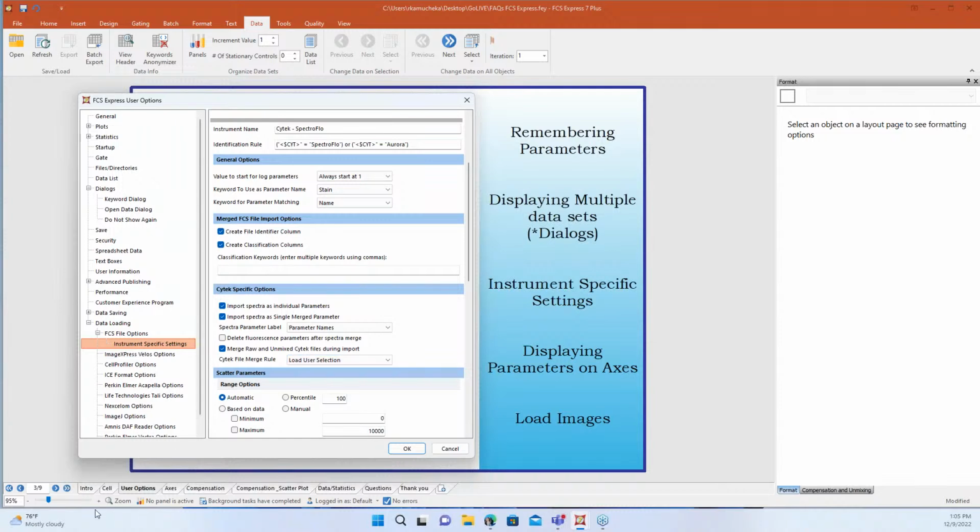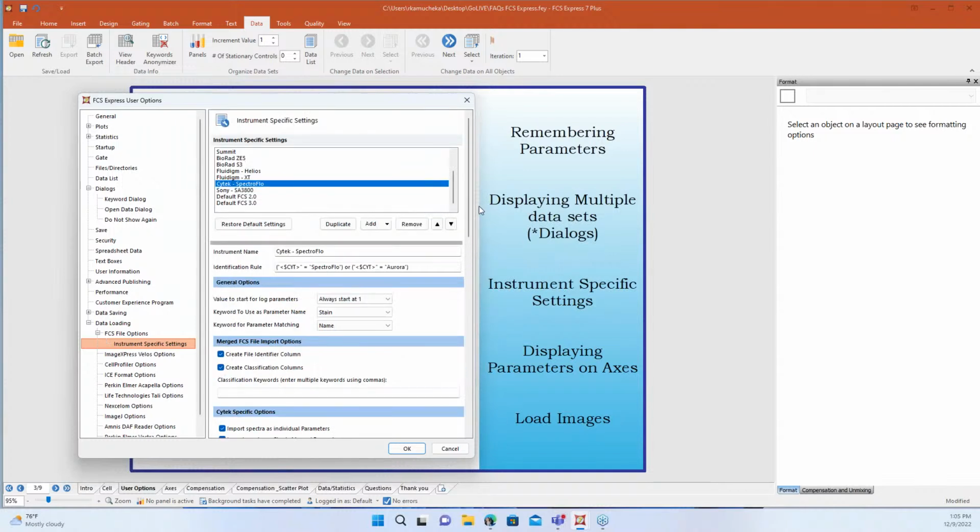Yep, I would panic too if I was doing a 30 parameter experiment and all of a sudden I just saw forward and side scatter. It can be a little much when you're like, oh my gosh, there's nothing, I did it all wrong. So if you're a new user, don't worry, it's not you, it's just a button, and you just need to uncheck a box there and you'll be good to go.